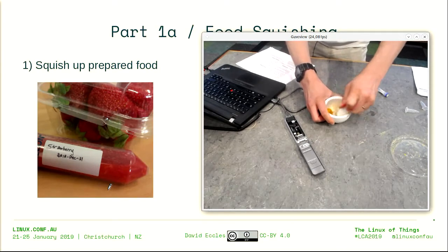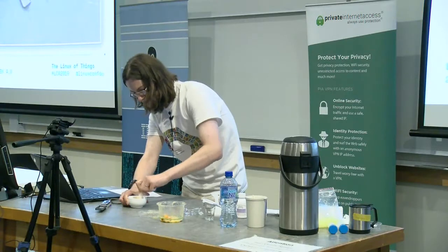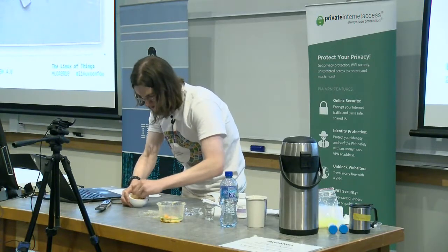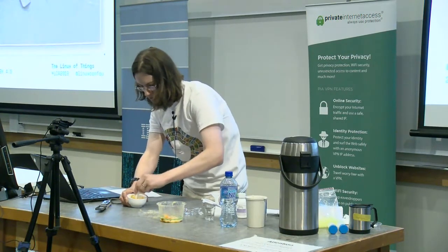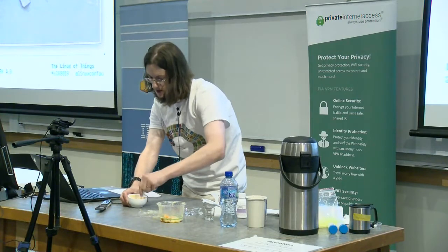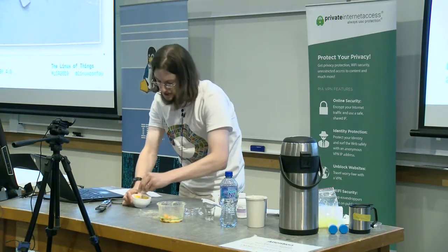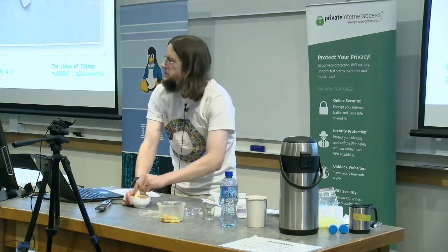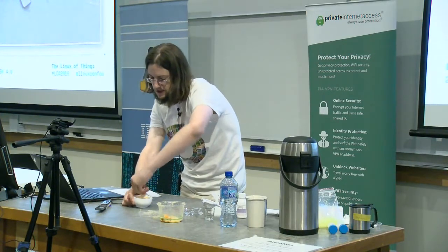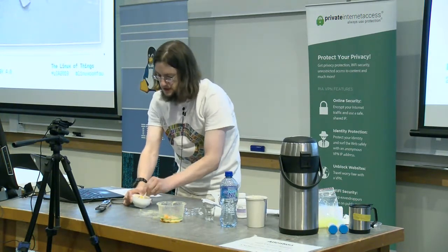Okay. So what I'm trying to do here is make sort of a chickpea soup out of the chickpea and the pumpkin. So that's what I'm doing here, grinding it up to try and liquefy it a little bit. Now, what I'm doing is sort of trying to squish up the cells and force the DNA out of them. I know that most of the cells are quite resilient, but I'm hoping that there's going to be enough here that I will find useful amounts of DNA in here.